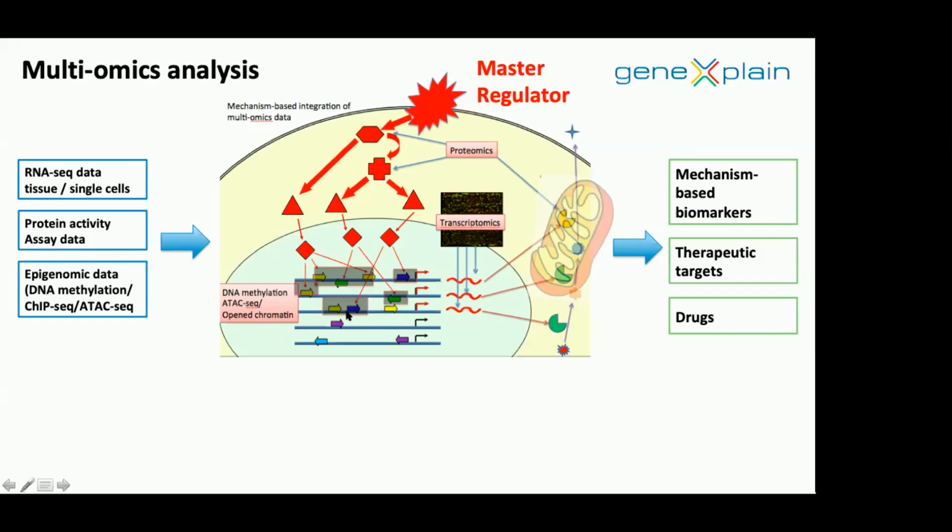Then the algorithm will take these regions into account, giving more priority to those regions when searching for transcription factor binding sites. If these data are available, they will be included by the algorithm and will improve the quality of the predictions. If they are not available, it's also fine, like in this case. We are still waiting for epigenomic data to come for the COVID infection.